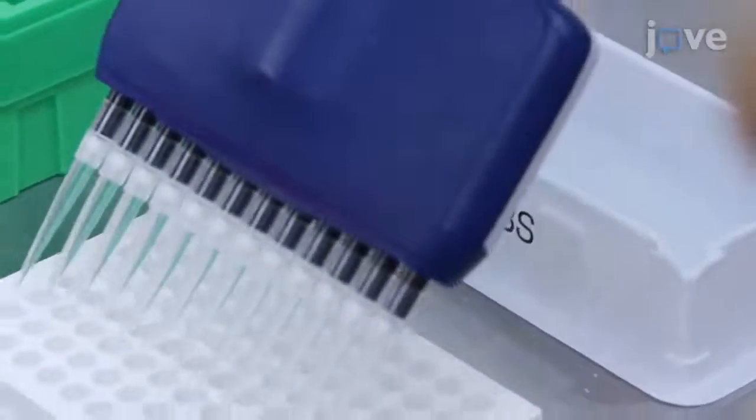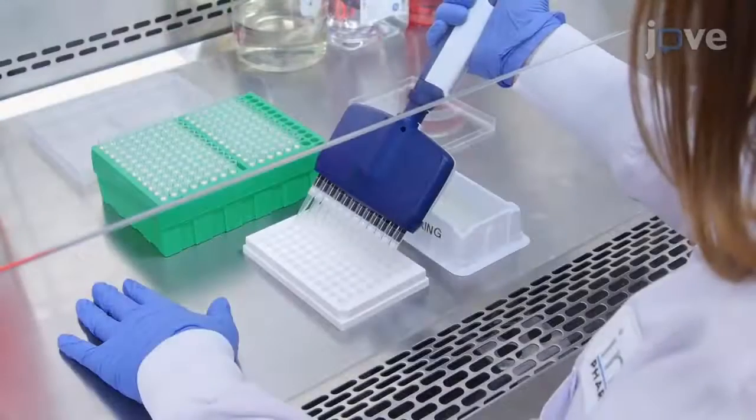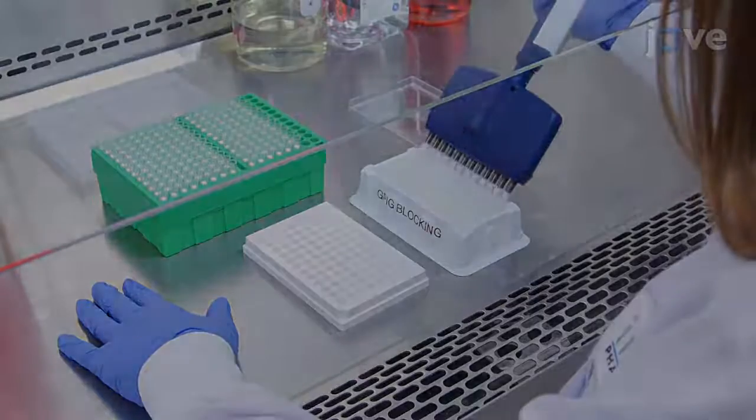After the incubation period, wash the plates three times. Add 200 microliters of blocking buffer to each well.